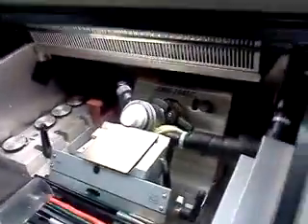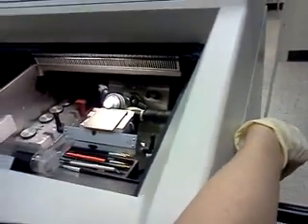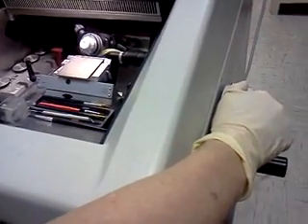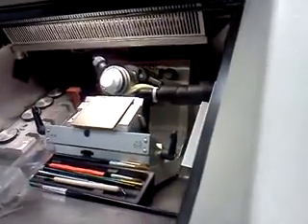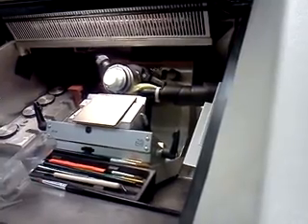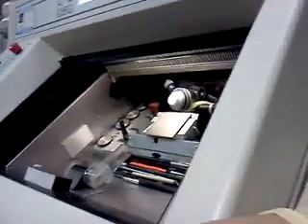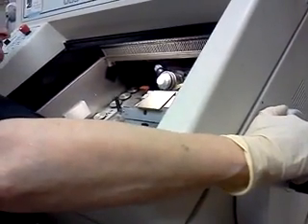Okay, now I need to get over here. See, that is too close. If I let it go through, it's going to knock that thing off the block because it's too big of a chunk that it wants to cut. That's when I have to use this to make it go back. Trim? No, actually, it doesn't have to trim to do this. This has nothing to do with trim, but we won't be trimming as much as that. We just want this to go better. I don't know why it's not. Is it?